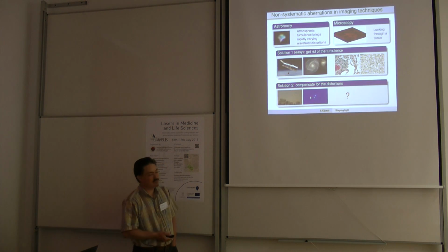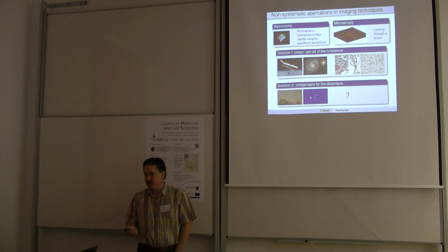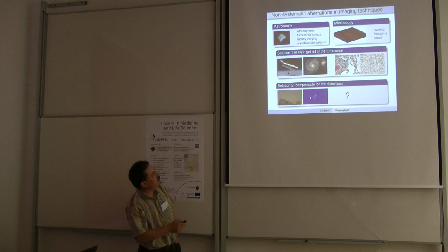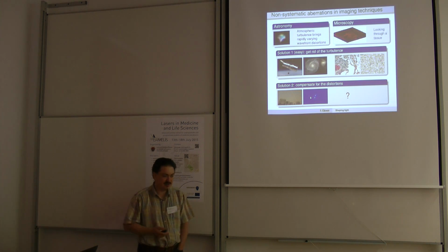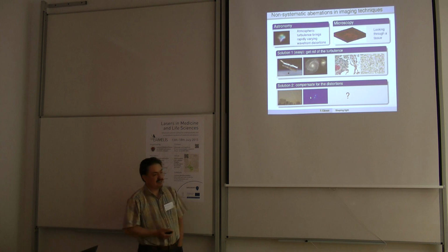Now in microscopy and medicine, we have pretty much the same problem. We have tissues that are really turbid. And we can do the simple solution: we just take a knife and chop off all the obstructing tissues, which is histology. People have done it for years. But you can't do it in vivo in many cases, and the price for it is basically very huge.